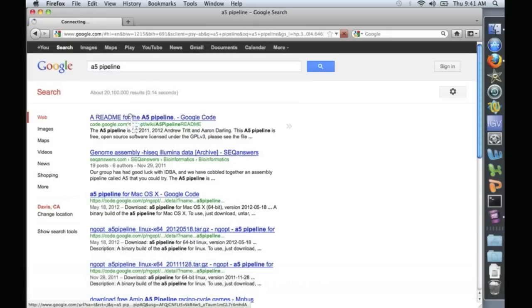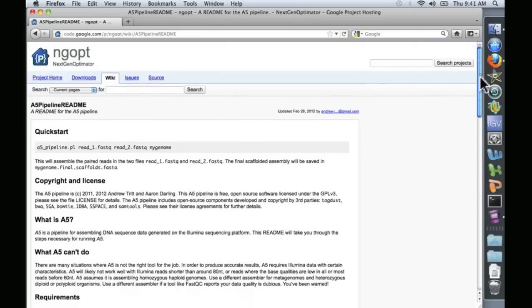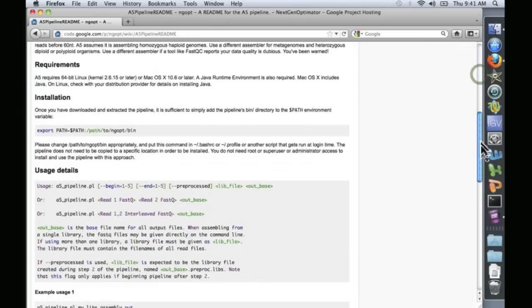Here it is, the first hit. Takes you straight to the README, where you can read all the technical details if you're interested.